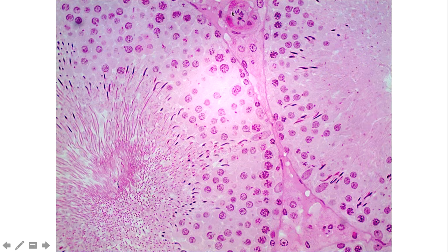So again, we have blood vessels out here. This is going to be the vascular tissue around the seminiferous tubules, and it's within here that you'll find these very prominent cells with very nice large nuclei. These are the interstitial cells.